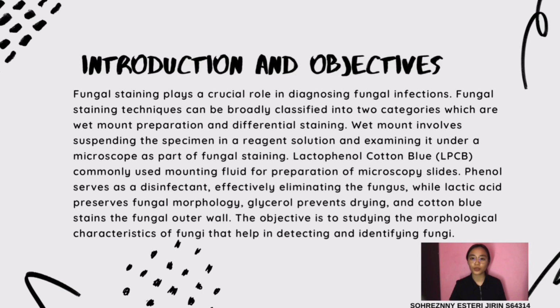So the objective of this study is to study the morphological characteristics of fungus that help in detecting and identifying the fungus.